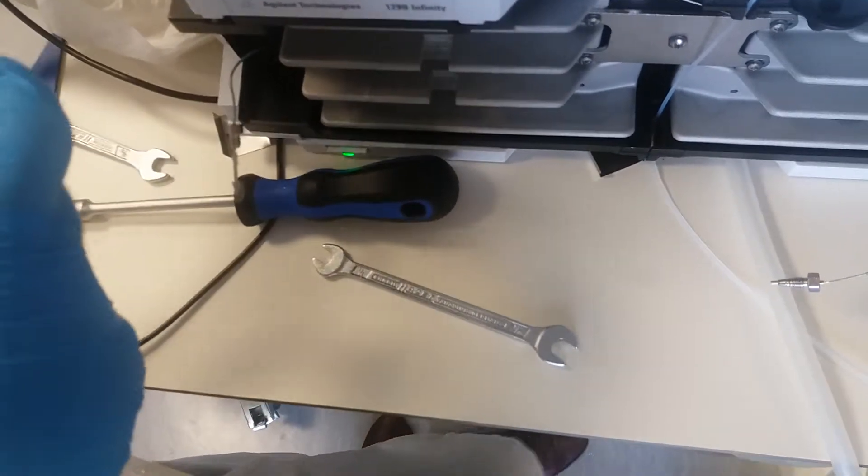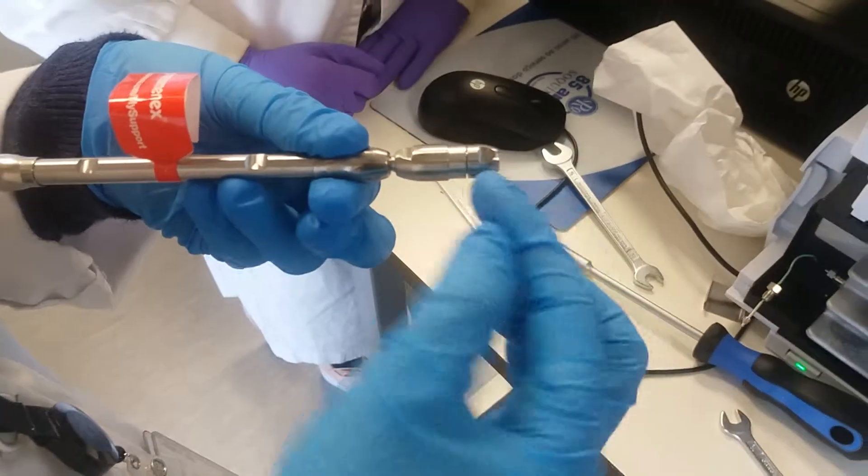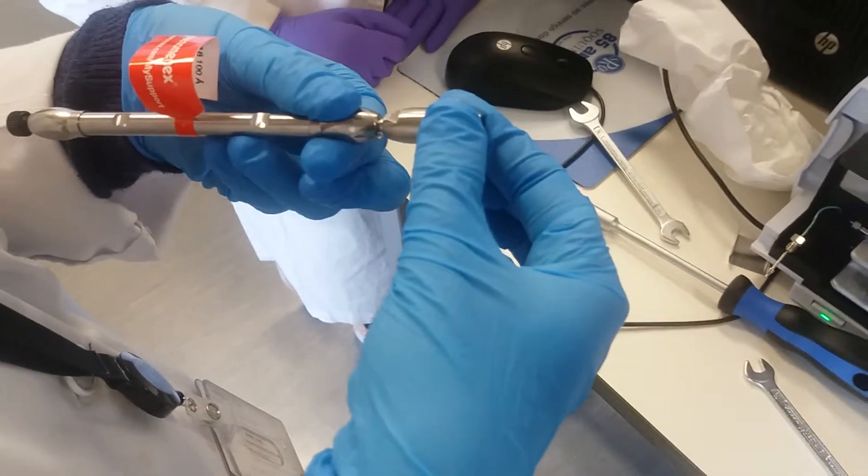Now you will use this column always with this pre-column, so you can store them together.